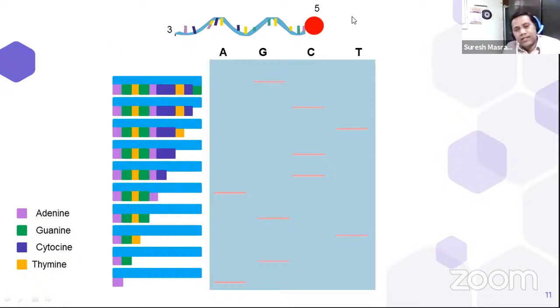Now, in the second, we pour the content of the second centrifuge tube, where we know that replication is arrested at the level of guanine. In the third, replication is stopped at the cytosine, and in the fourth, the replication is stopped at the level of thymine.